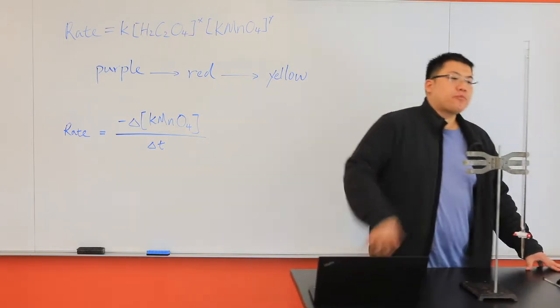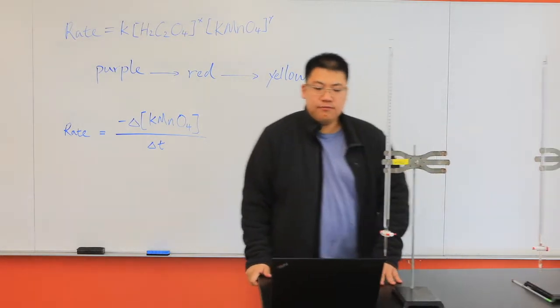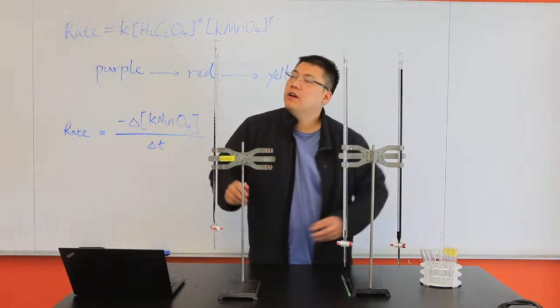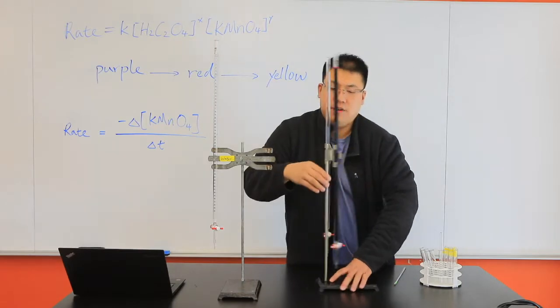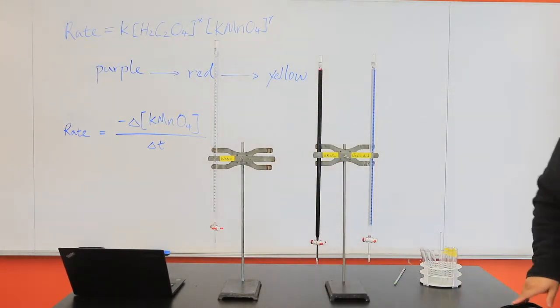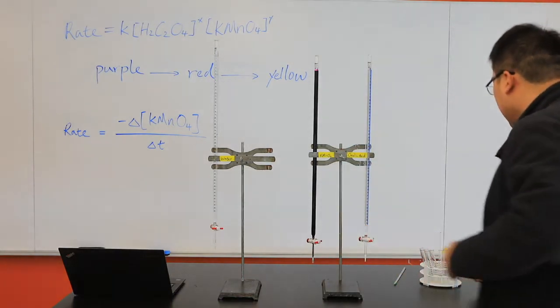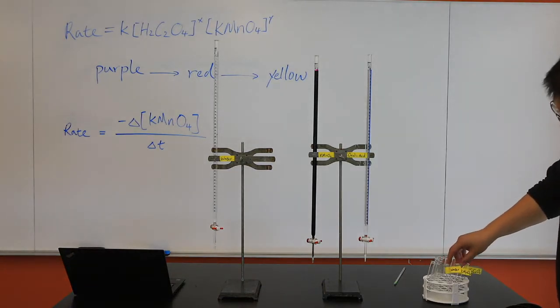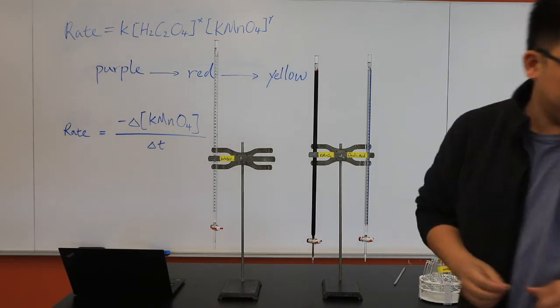At here, I have a burette full of water. Over here, I have two more burettes, one filled with potassium permanganate, another one is the oxalic acid. I also have a few test tubes on the side to obtain the required amount of the reactants.